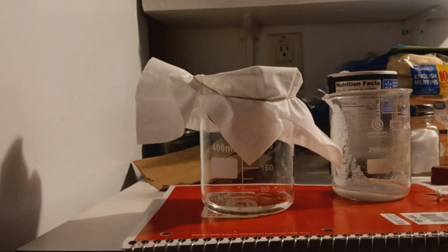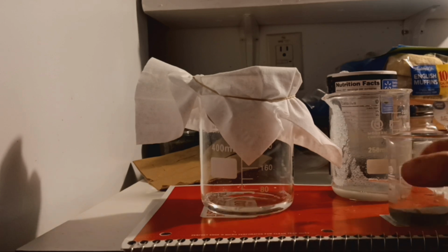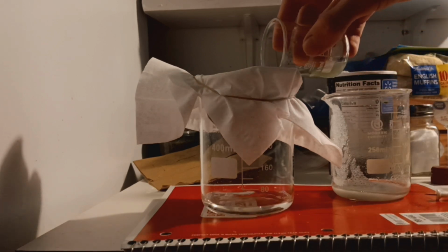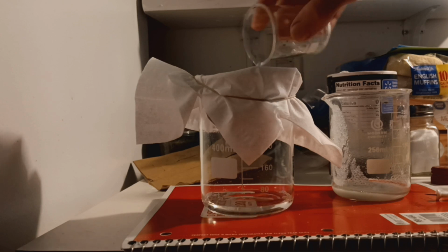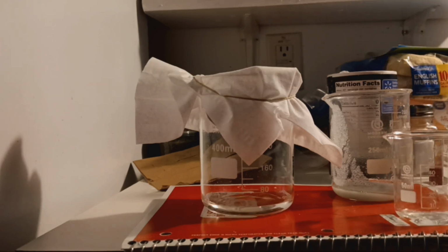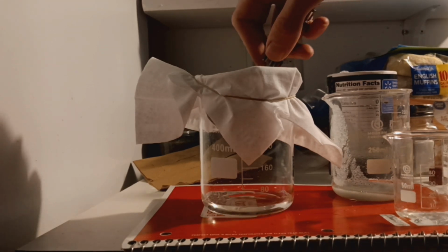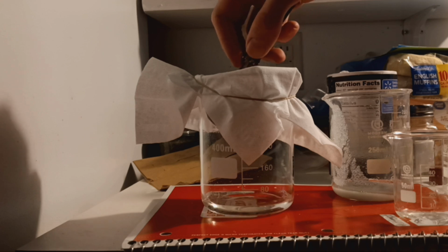This is a waste byproduct that we won't even use for anything, so I must decant all the liquid without spilling this into the filter. Otherwise, this would be a contaminant and would ruin the results. As usual, the liquid goes from a very different color to almost crystal clear. It is so clear, in fact, that I don't believe this is water, but rather our original electrolyte solution plus some very spooky sodium hydroxide.